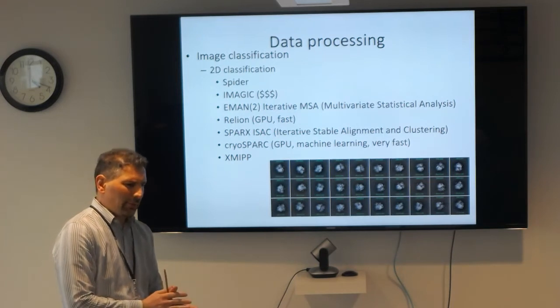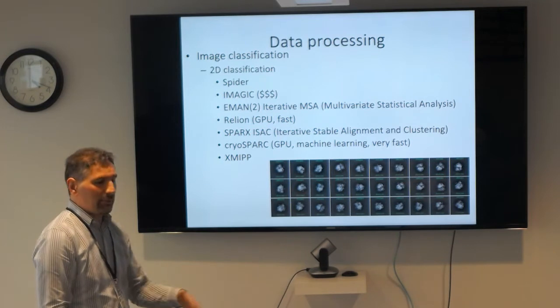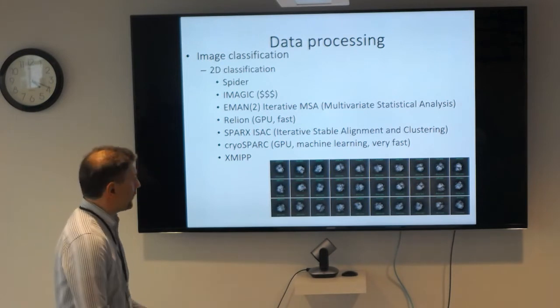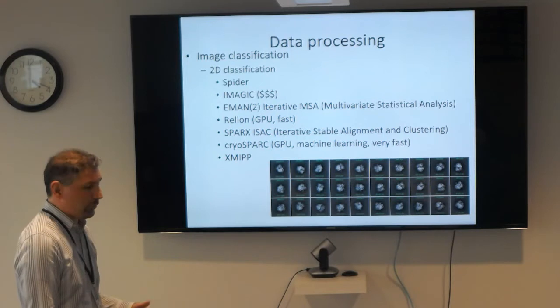Pavel Penczek is working on this, and he's always making it a little bit faster. So at some point, it may be on a GPU, and it may be the go-to routine for 2D class averages. CryoSPARC is on here, and it uses GPU machine learning.